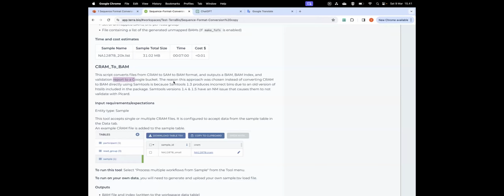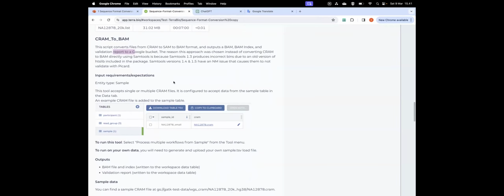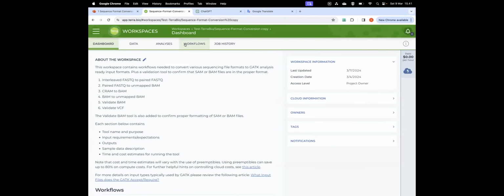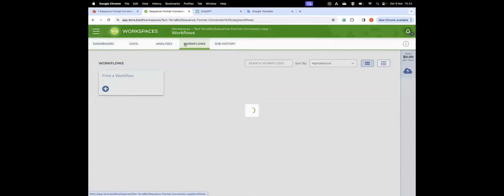All right. So, like Jacqueline does, all we need is to go to workflow.